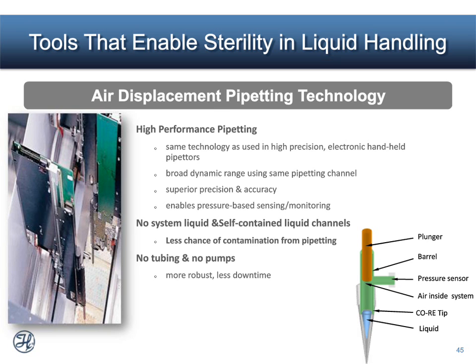And the nice thing about air displacement is there's no system liquid or self-contained liquid channels, so you don't have to worry about maintaining those on a regular basis, and it reduces contamination risk and also allows for no tubing or pumps.